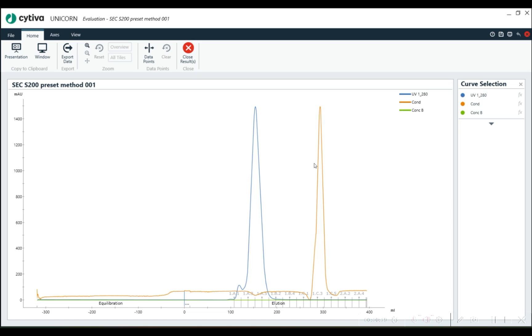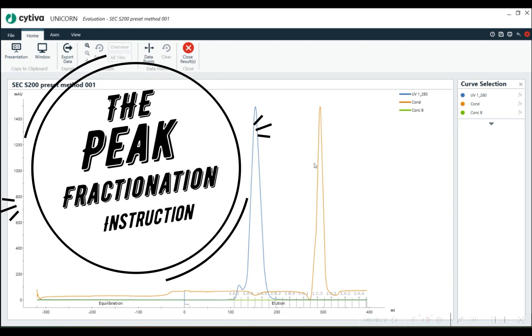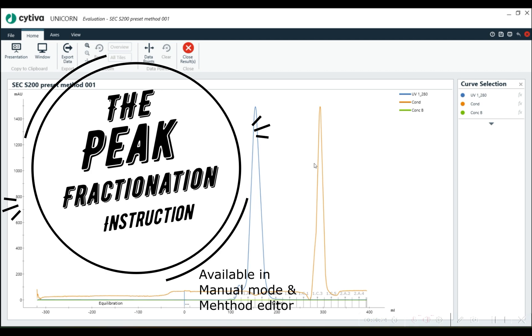Hi everyone, thanks for joining me. Chad here. Today I want to do a little bit about a particular instruction that's my favorite, which is peak fractionation.